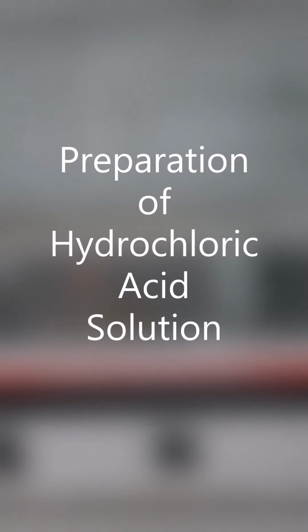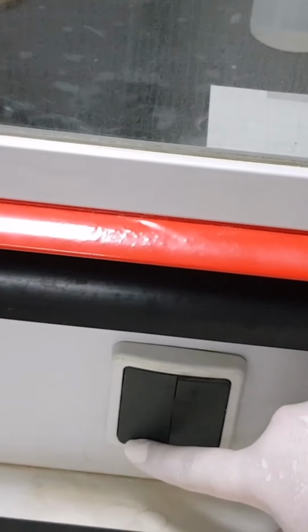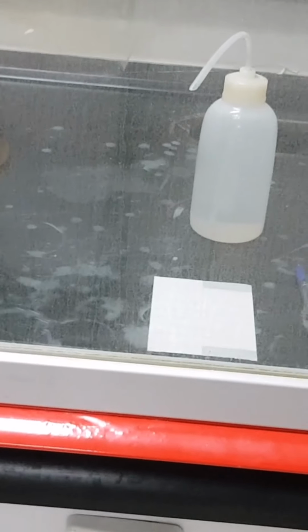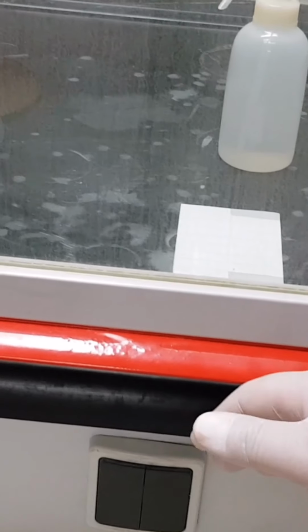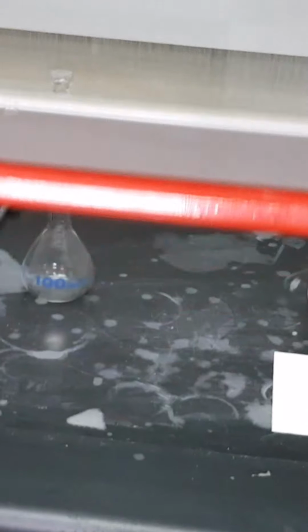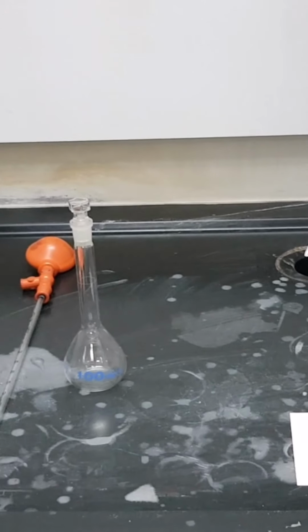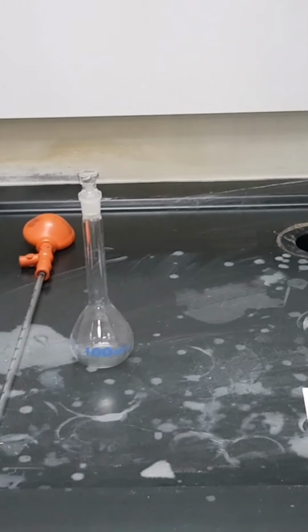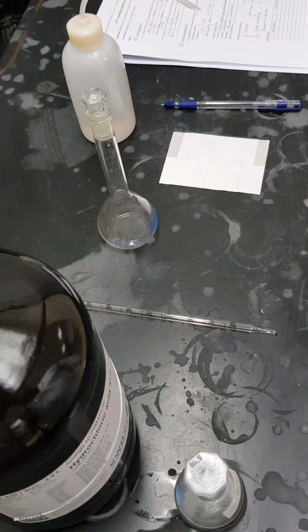Now we are going to proceed with the preparation of HCl solution inside the fume cupboard. So first of all, we have to run the suction and the light, both of them. Then we have to place our hand here to make sure that there is suction force, so whatever toxic fumes are inside the fume cupboard are already sucked out. Then we can proceed. We will keep it open till this range so we can protect our face in case of any harmful event, and we will proceed right now.